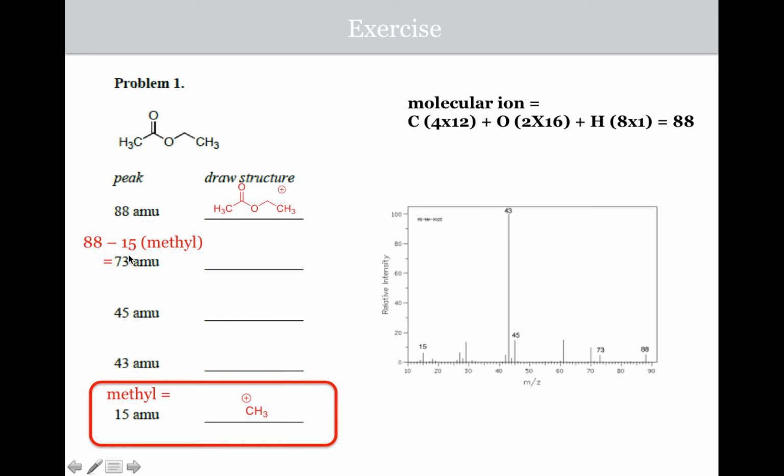So I know the molecule lost 1 methyl group. And as I said, there are 2 possible loss points, so 2 fragments are possible for this mass. One lost this methyl group, and the second fragment lost the methyl group from the carbonyl end. If you draw both of them, it will be helpful to identify the other fragments.